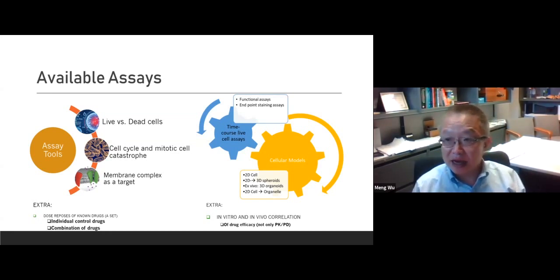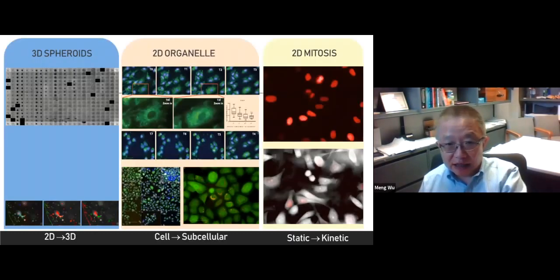We always do kinetic. And that's why we're also working on the last point, in vitro, in vivo correlation, to make sure the different assays we use for in vitro plate-based can be used later on for in vivo.